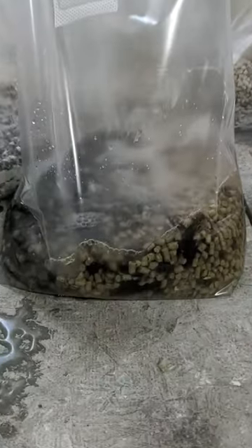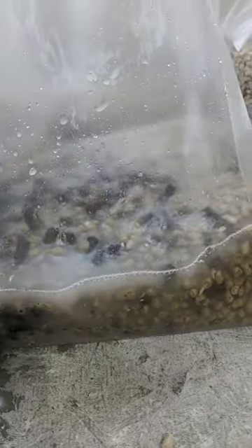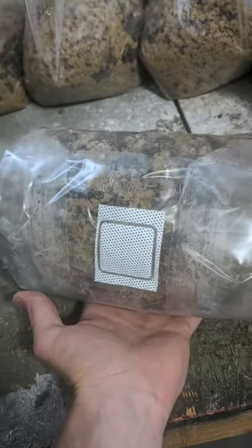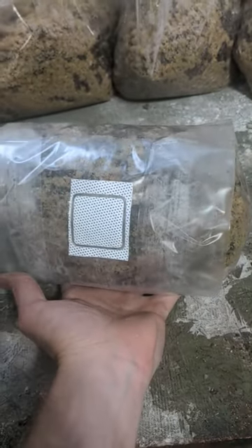Once all the water's in the bag it'll take a couple minutes to start soaking in. Shake it up just a little bit. Once the bags have absorbed most of the water, fold them up like this — nice folds on the outside. Put the filter patch out and then we'll put them into the sterilizer in a cross pattern, alternating going all the way up. This holds 24 bags in my sterilizer.